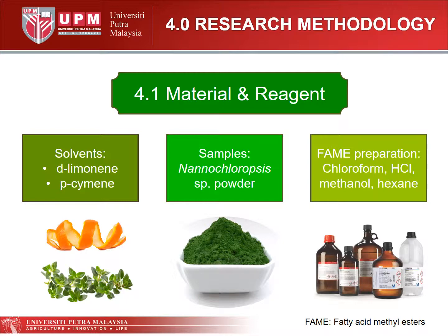Research methodology. Part 1 is about materials and reagents. Solvent: for the extraction, we are using D-limonene and p-cymene. D-limonene is from citrus peel and p-cymene is extracted from thyme leaf. For the sample, we are using Nannochloropsis species powder, and for the fatty acid methyl ester preparation, we are using chloroform, hydrochloric acid, methanol, and hexane.